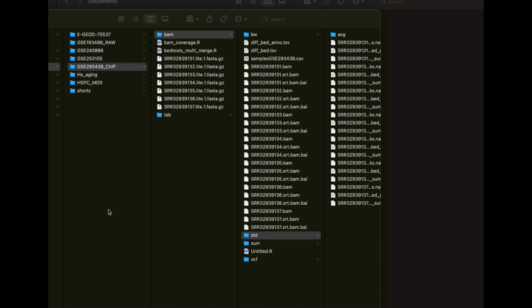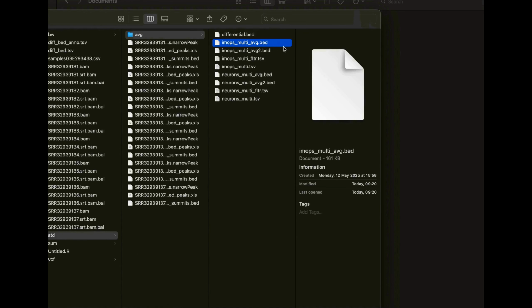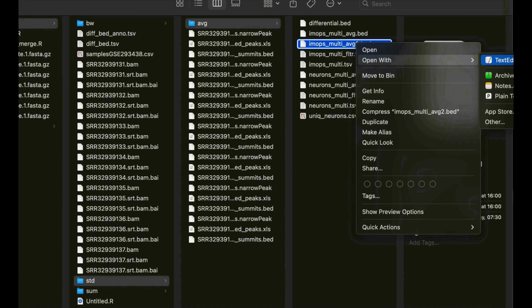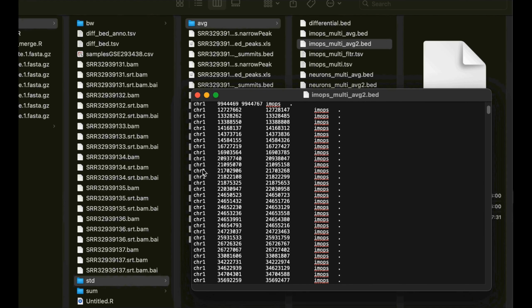In this exercise, I will use the same dataset as before, publicly available, where I previously generated average bed files. Details do not matter much, you just need two bed files with a minimum number of columns 3: chromosome, start and end position of the peak. That's enough. Although you can take a version of 5 columns, it doesn't matter much.